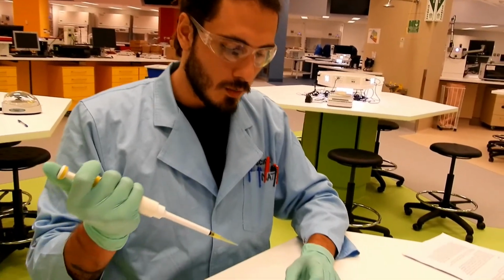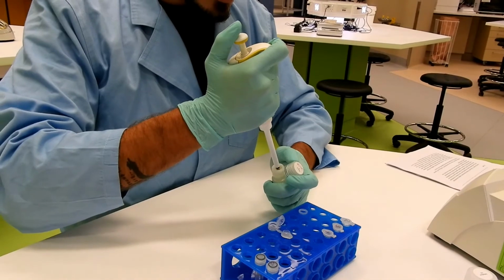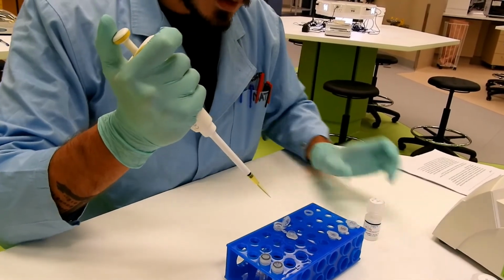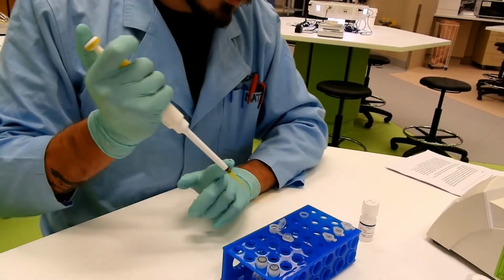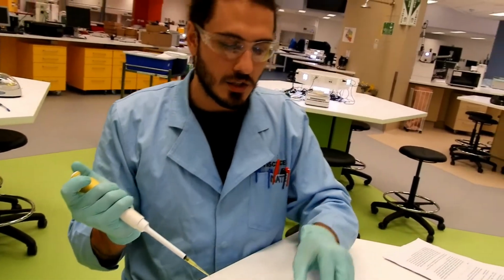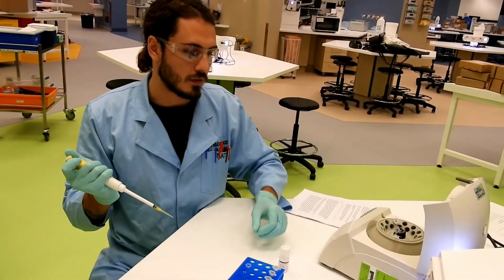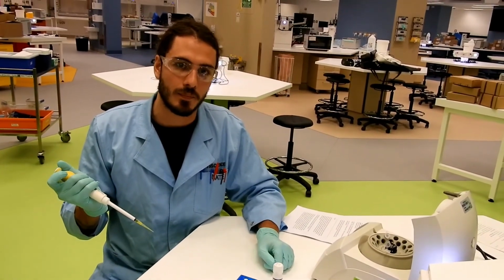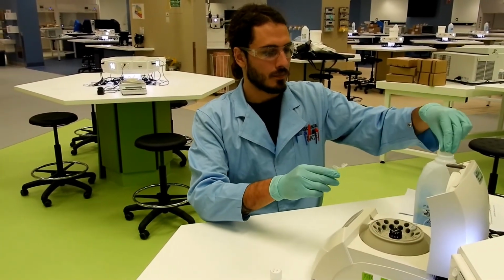To do this, we'll pipette 100 microliters of 10 millimolar Tris buffer onto the filter, and this Tris buffer releases the DNA into the collection tube. We'll then add the tube to the centrifuge and centrifuge at 10,000 g for 1 minute. Now we'll discard the spin filter.